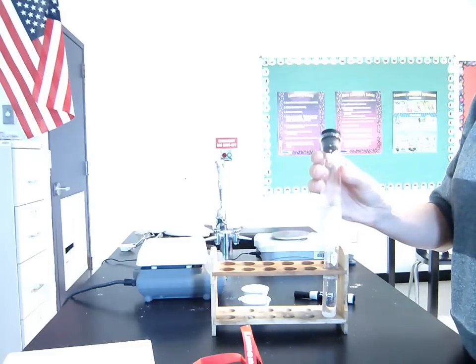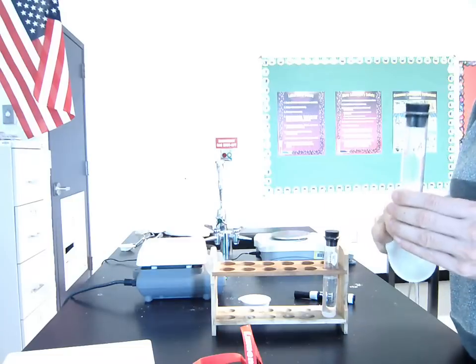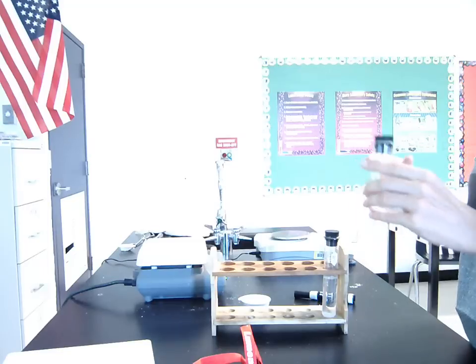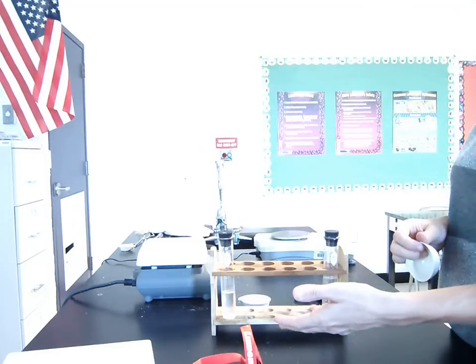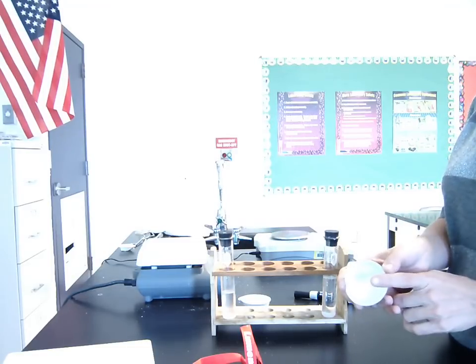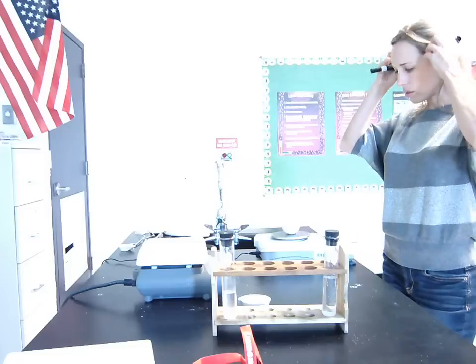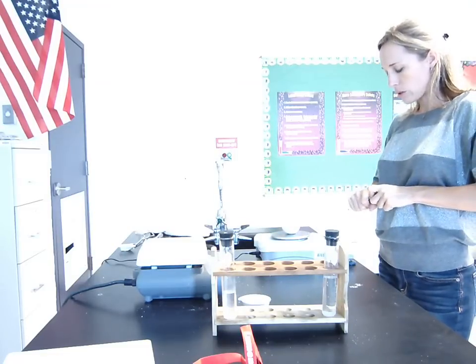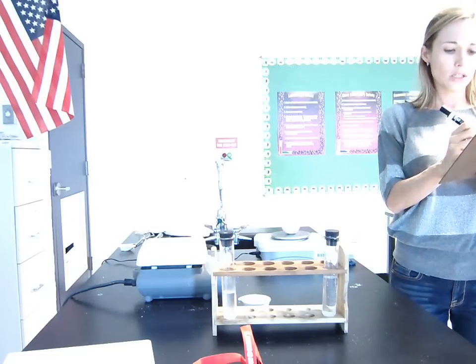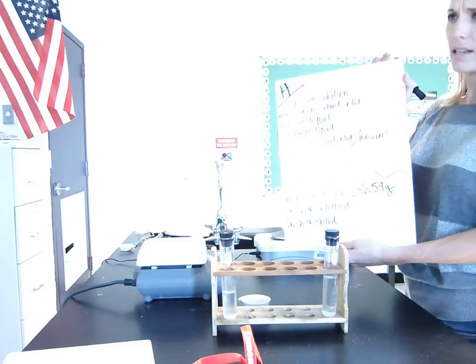So what I want to do first is pour a little bit of solution into a container, and figure out how much sample I'm going to start with. Okay, so I want to figure out the mass of a sample. Now, because it's a liquid, and I want to get the mass, I obviously have to have some container to put it in. So I'm going to mass the container first. So let's do that, and we'll write it down. We'll start with substance A. The massing dish that we're going to use for substance A is 26.59 grams. Okay, that's important because we're going to use that number.